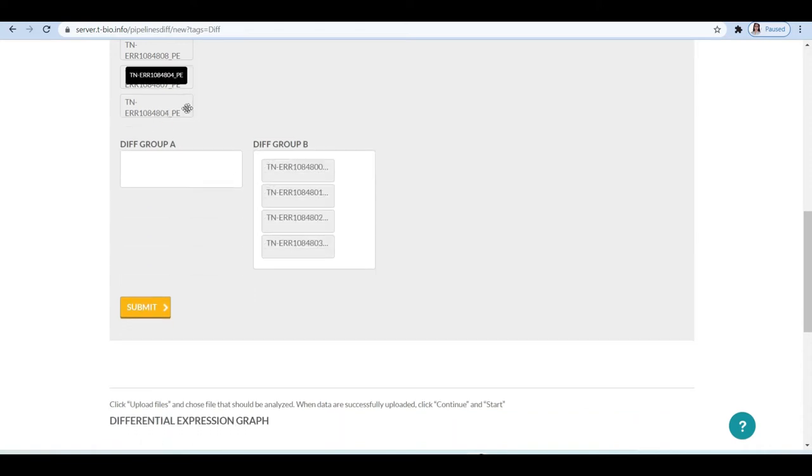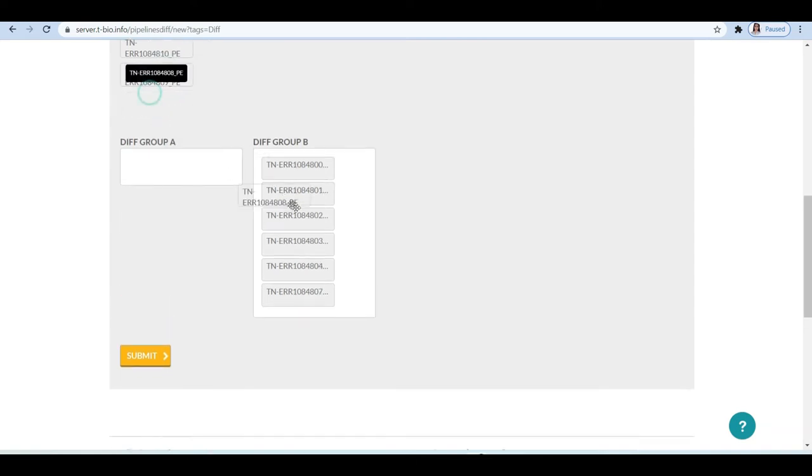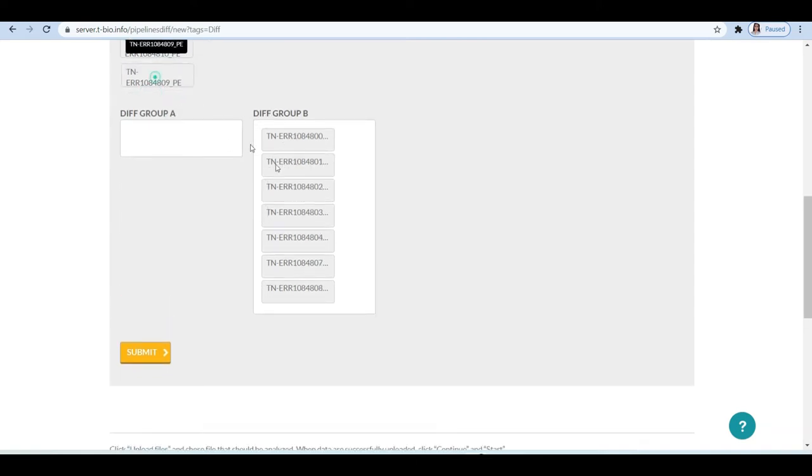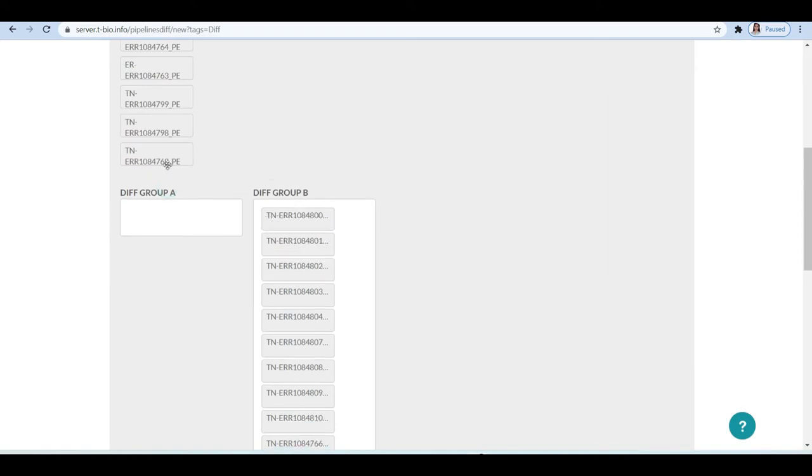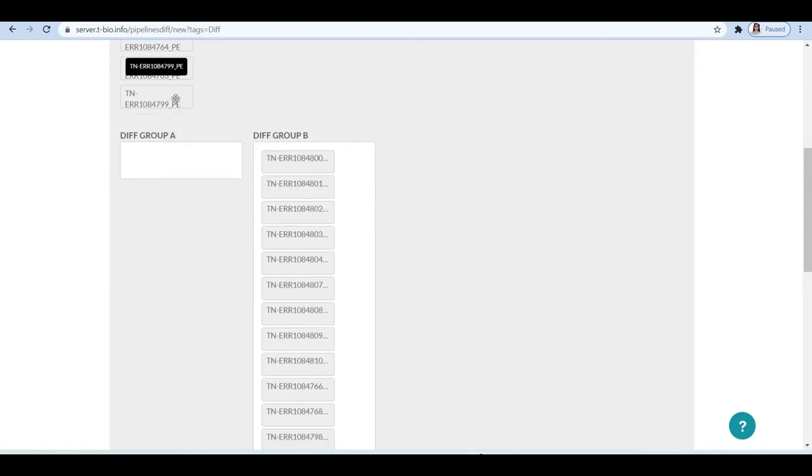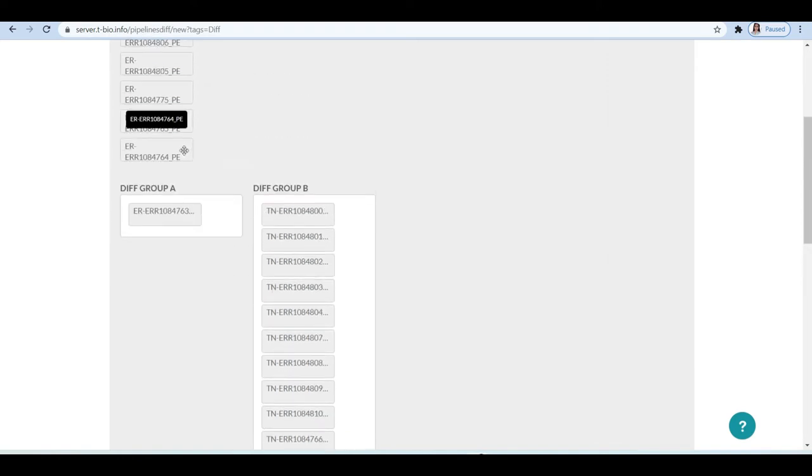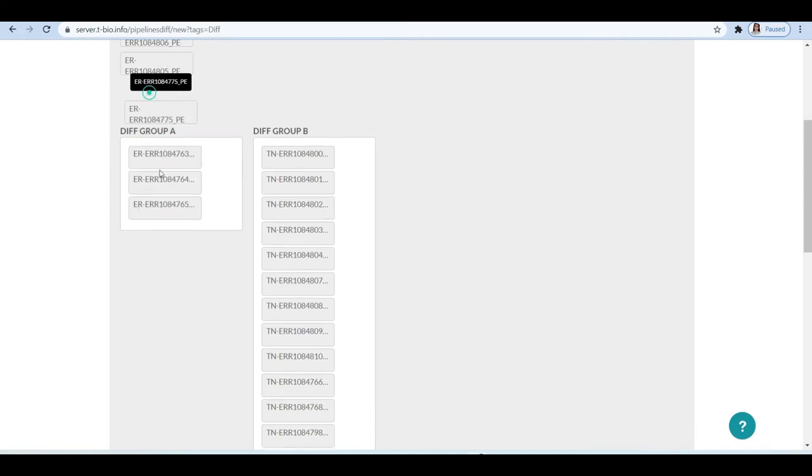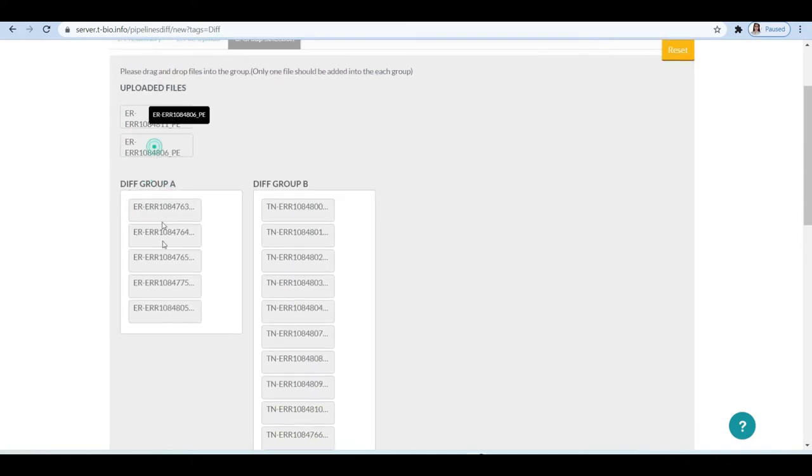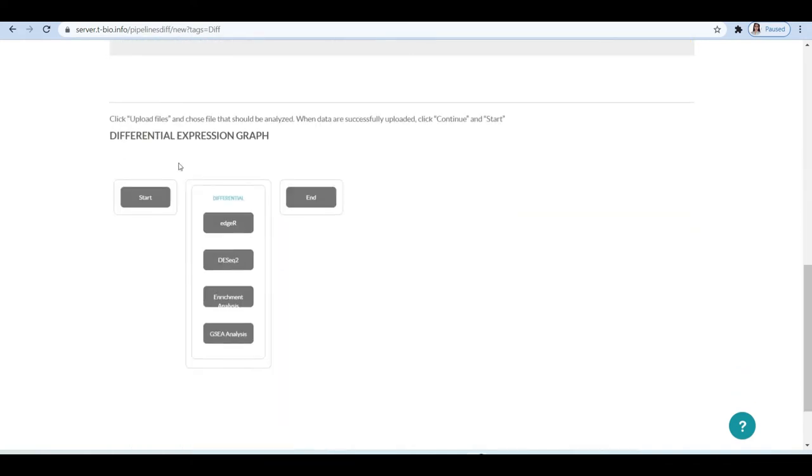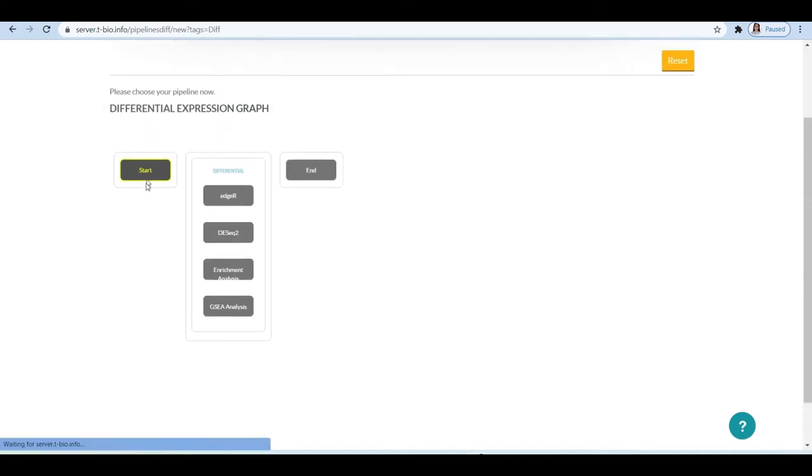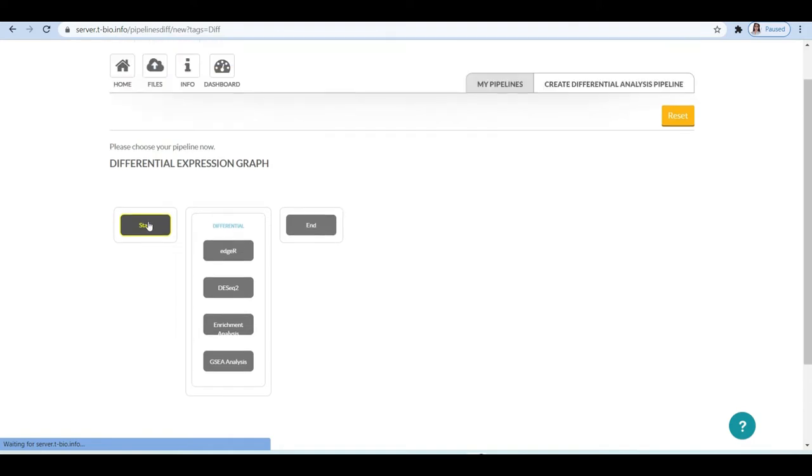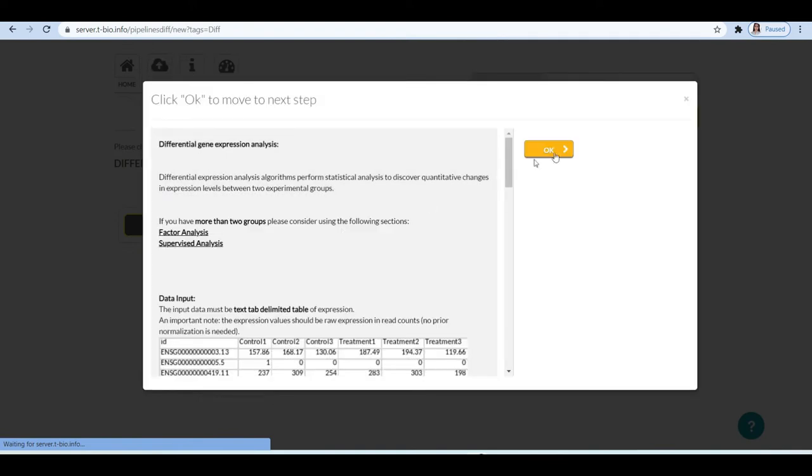After data upload, make sure to drag the samples into groups. It is important to remember what was your group B, since when you interpret your results, it would be with respect to group B samples. For instance, whether genes are upregulated or downregulated in group B. Thus, it is recommended that you should drag control samples in group A and test condition under study samples in group B. Let's take forward all the ER-positive samples in group A and triple negative in group B. Now, click on the start button to build the pipeline.